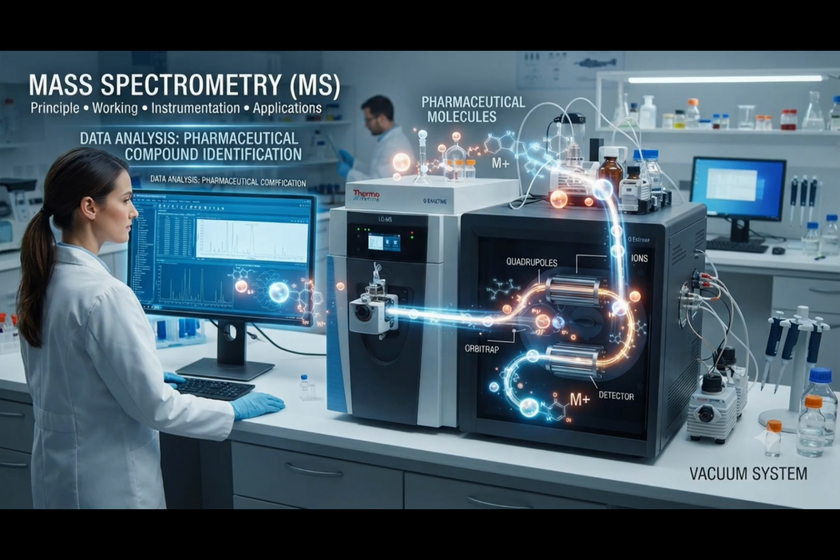Mass spectrometry is widely used in pharmaceutical analysis, analytical chemistry, bioanalysis, forensic science, and research. In this video, we will understand the complete working principle of mass spectrometry, including ionization, mass analyzers, detectors, mass spectra, and major applications.